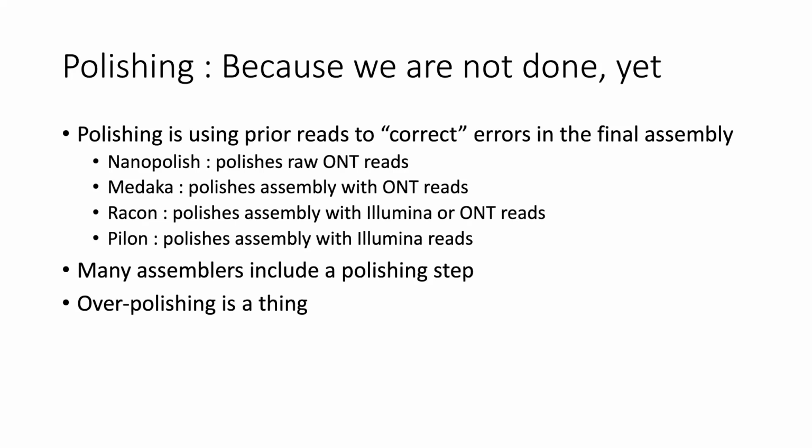And with Pilon polishing, you generally do it in multiple rounds until the polishing results in no sequence changes. This does come with a caveat, though: Pilon polishing is a hybrid approach. So you need your nanopore assembly, and then you need Illumina reads. If you're only dealing with nanopore reads, or only PacBio reads, Pilon isn't an option for you.